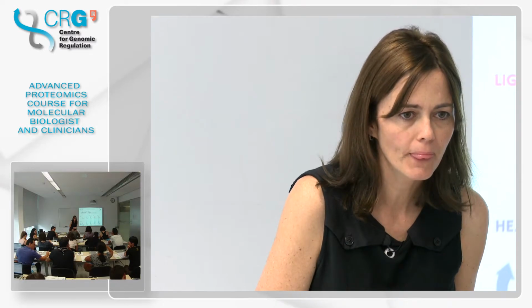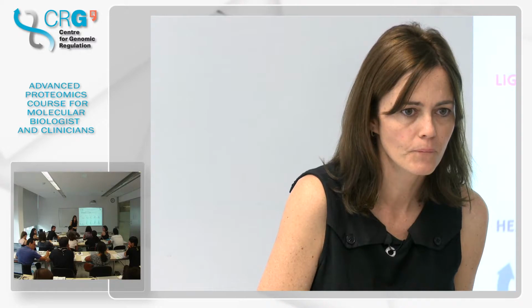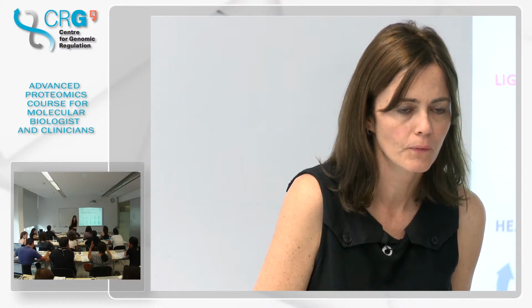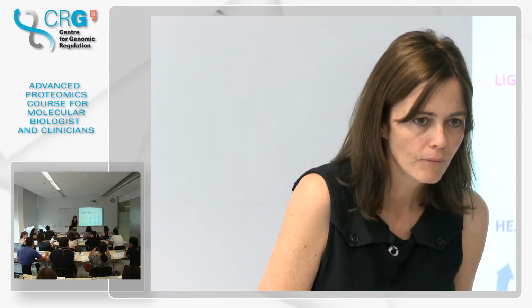Just to confirm: if this were our spectrum view, then they would obviously be heavier on the mass-to-charge scale. But because we are talking in terms of retention time, they are exactly the same. Exactly, because this is retention time. This is not mass.